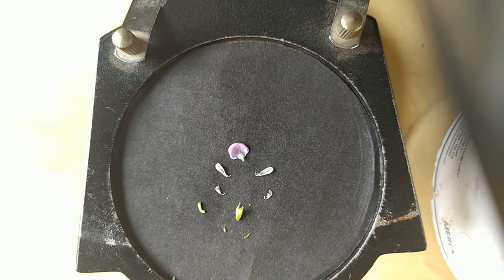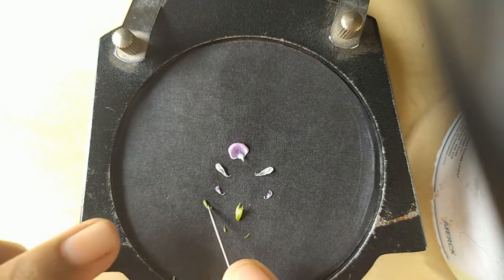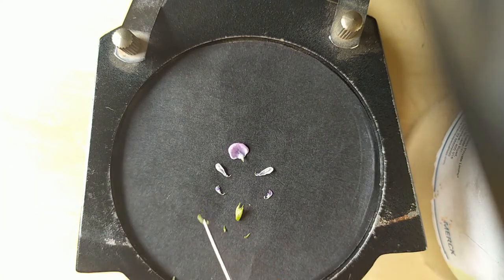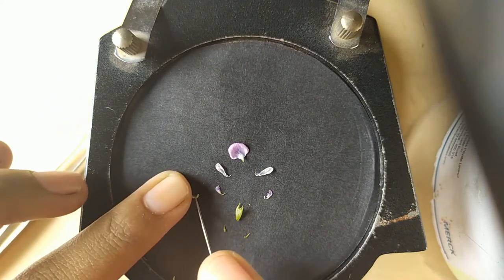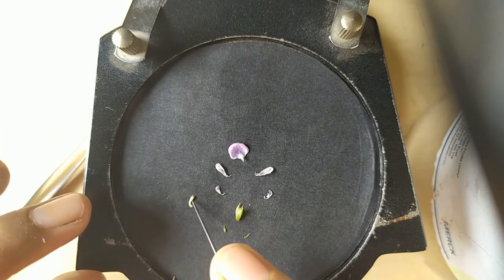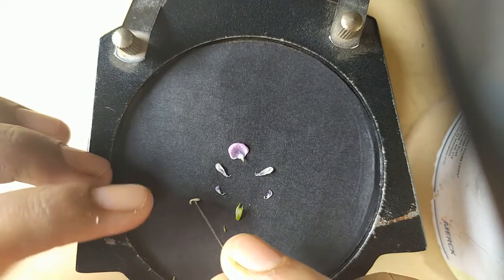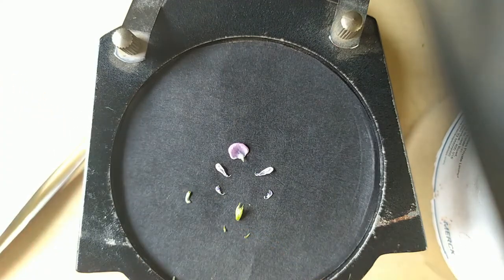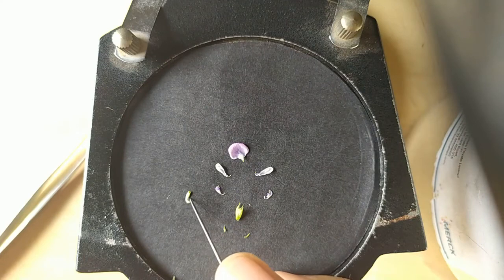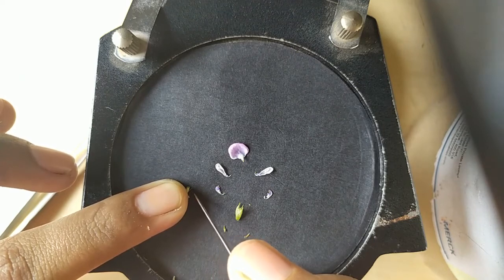See here, the 9 plus 1 condition of the anthers I am showing to you. See carefully, the thread like structure is present here, and one single anther is present at the base. You can see very carefully that one anther is attached to the base. I am going to separate out this anther.